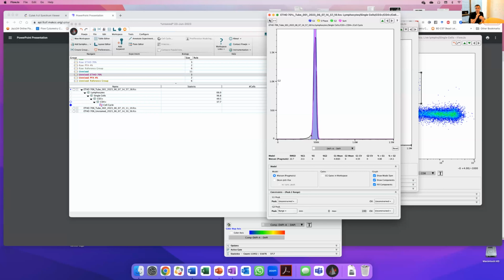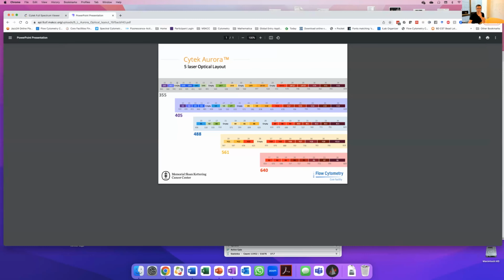And I think that's it, in a very quick way. I was going to show you how to do the analysis with the raw data, but we've already gone 15 minutes over. You can do it with the raw data if you know what the peak channels are. Like I showed here, Kathy was showing UV7 is the best peak for DAPI. FITC would probably be the B2 peak, and so you could actually plot UV7, B2.